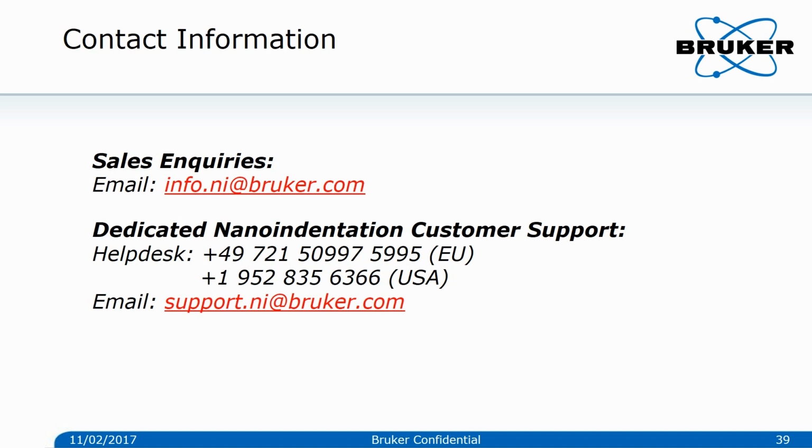The first question I have today is, how long can I run a creep test using the reference frequency technique? Could it be hours or even days? The reference frequency technique can be used for several hours if you want. Since the maximum number of data points that can be recorded per load cycle is limited, the data rate will go down for long tests. We have been performing reference frequency tests up to 10 hours so far.